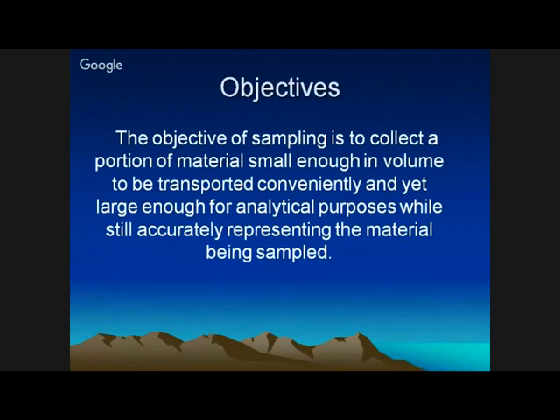And second is the source from where you are collecting the sample. What is the source? Whether it is an industrial effluent, or a domestic effluent, or any other contamination. So accordingly, you have to design the sampling protocol before going to the field for collecting the sample.